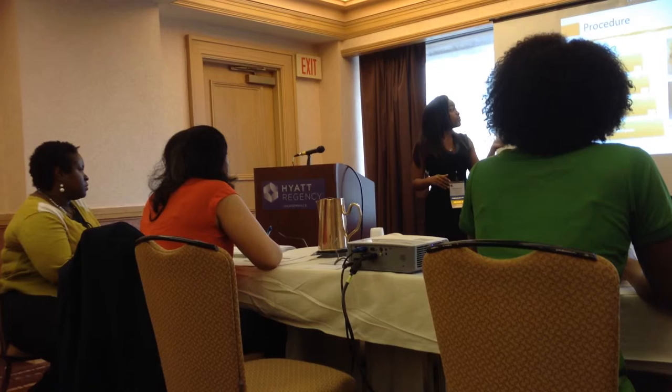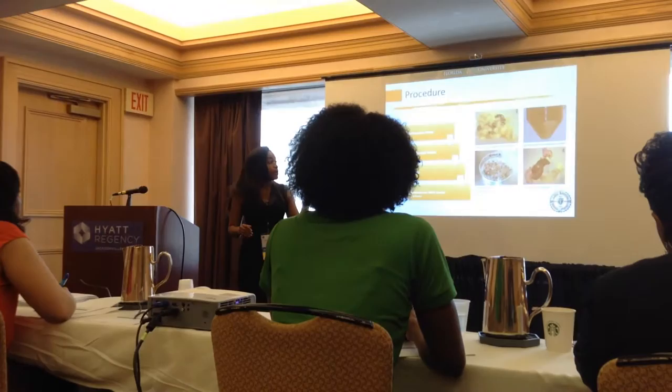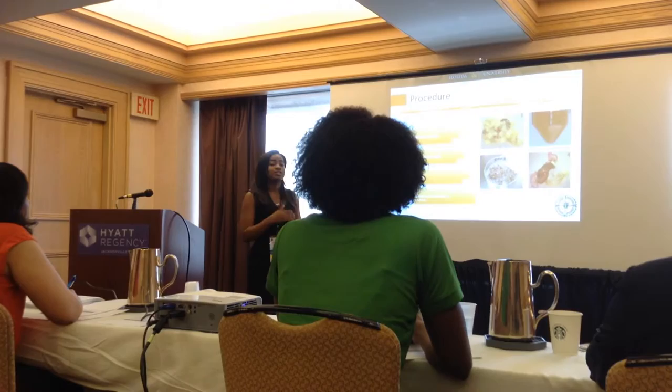I put them on a solid media. I went ahead and grew Agrobacterium tumefaciens. Now, this bacteria has an ability to insert genes into everything from bacteria to plants to even humans.